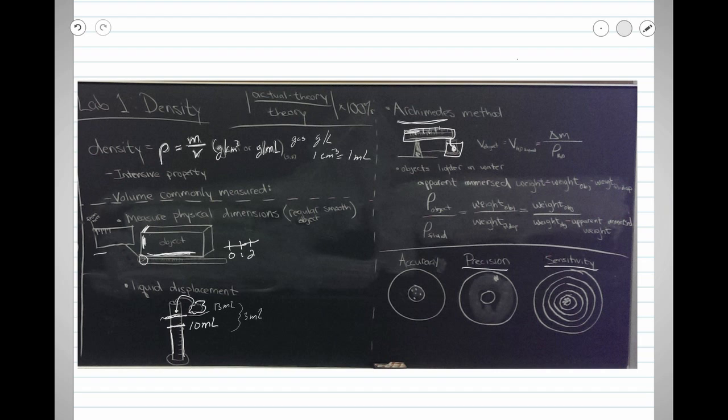All of this will help us verify that you got the density correct at the end. So you want to make sure that you put as much detail as possible, even if you have the code, for two reasons. One, with scientists, detailed observations are important. And two, because maybe the code was written down wrong, or we might have two number 35s or something.